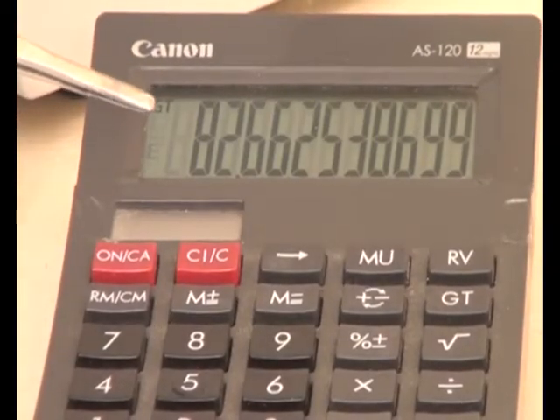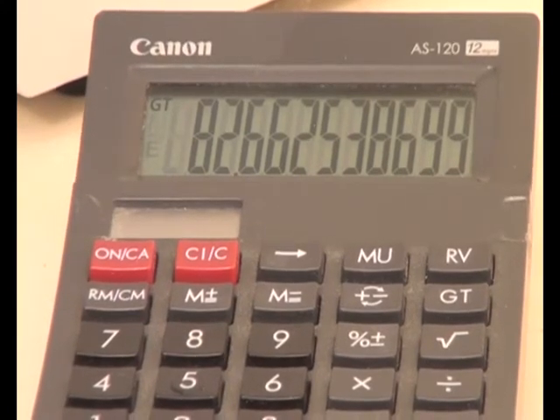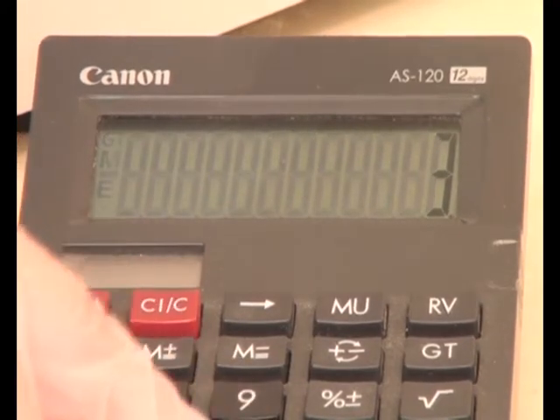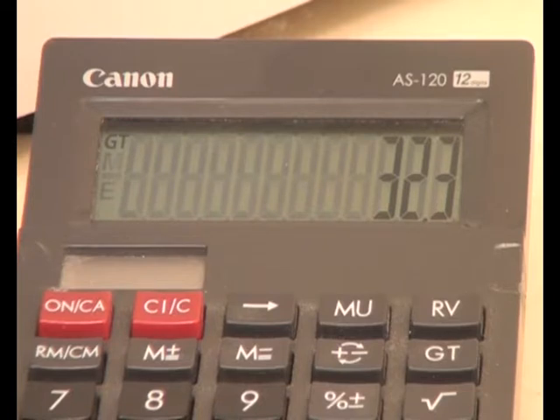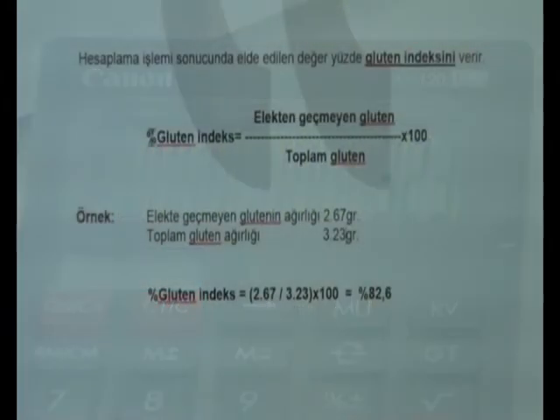The index value in this example is 82%. For calculating the percentage of total wet gluten, take the total gluten multiplied by 10; the total wet gluten result is 32.3%. For calculation of the gluten index, use this formula: Gluten index (%) = strong gluten divided by total gluten amount, multiplied by 100.